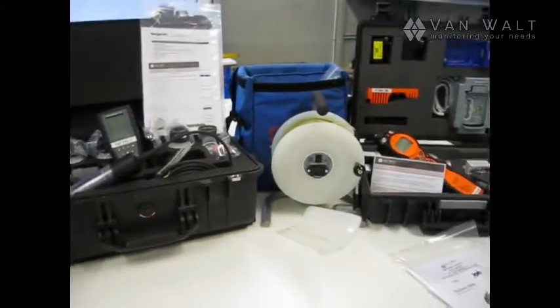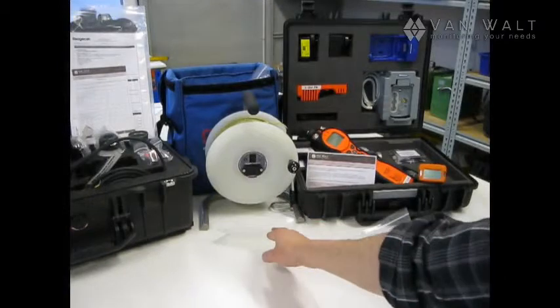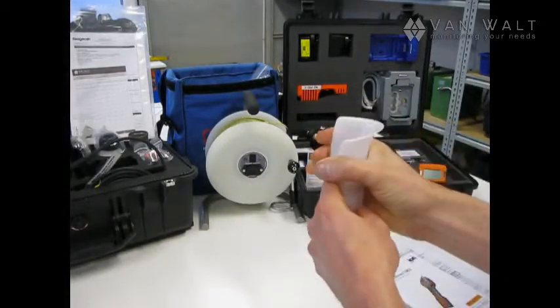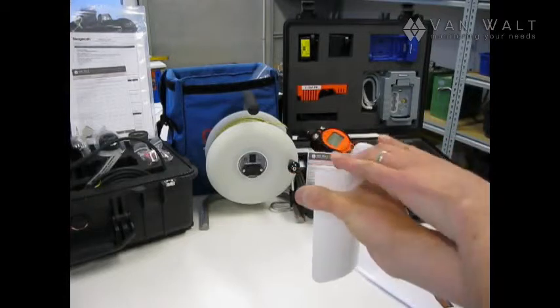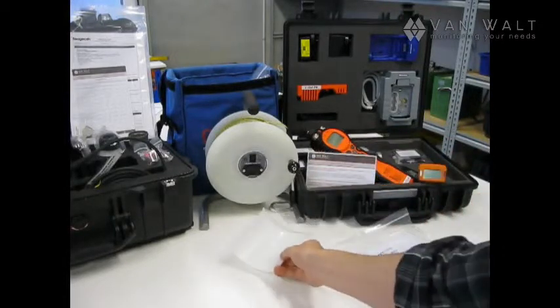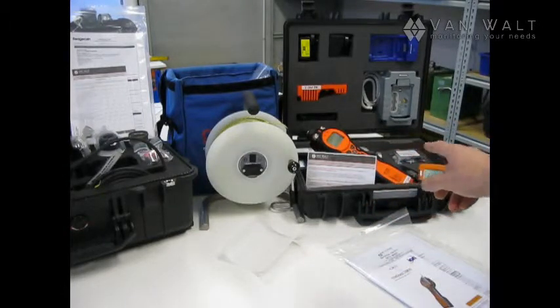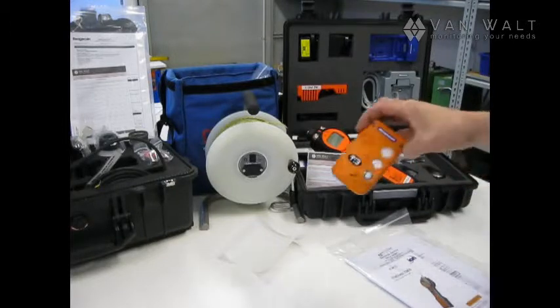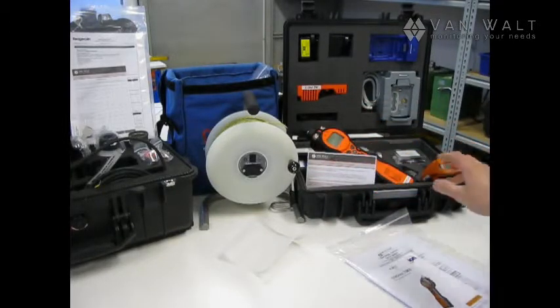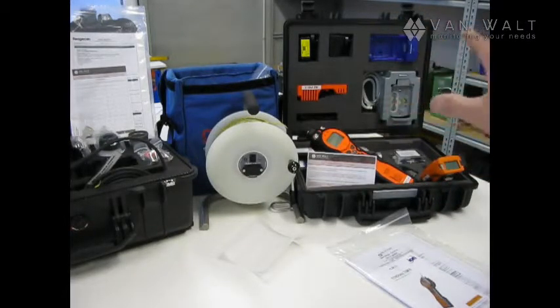Scrolling along, an oil interface meter that comes with a tape guard. Insert this into the well and that will stop your tape from cutting on sharp surfaces. And then we have our PID, the Tiger PID and the little Tetra 3 LEL unit and both those units come with Calgas S and their respective equipment.